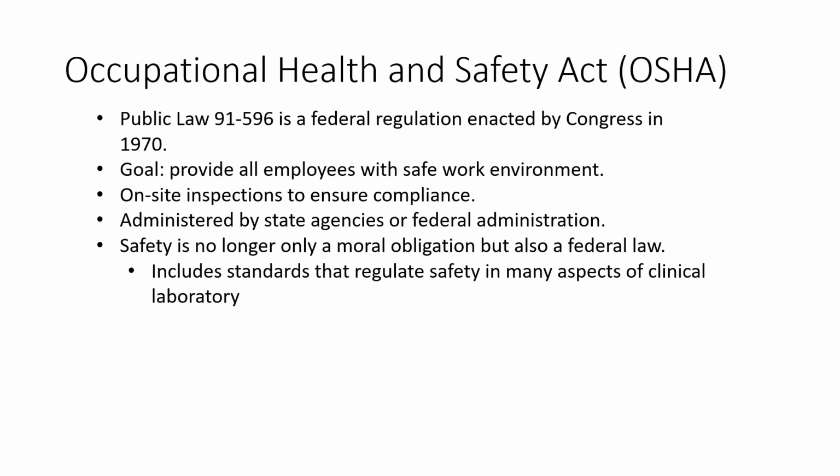So the Occupational Safety and Health Act, or OSHA, public law, is a federal regulation enacted by Congress in 1970. The goal is to provide all employees with a safe work environment. There are on-site inspections to ensure that there's compliance, and it's administered by state agencies or federal administration. Safety is no longer only a moral obligation, but also a federal law, and includes standards that regulate safety in many aspects of the clinical laboratory. If OSHA finds violations and those violations are not corrected, the laboratory can be shut down. So this is something that's pretty serious.